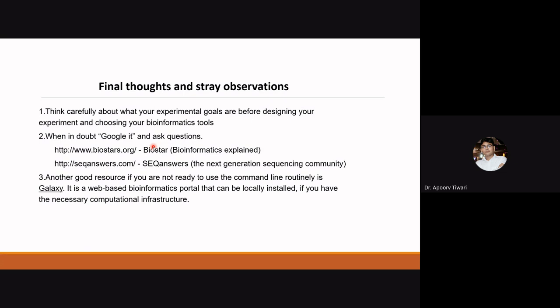As we have discussed, if you have the reference genome for your experimental data, like you are working on Arabidopsis thaliana, rice, or wheat, the whole annotated genome is available in the Ensembl Plants, TAIR, and NCBI databases.